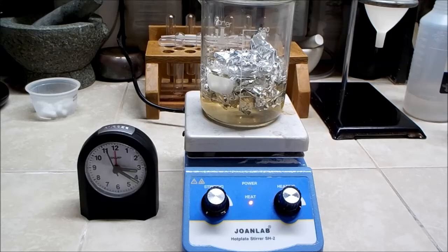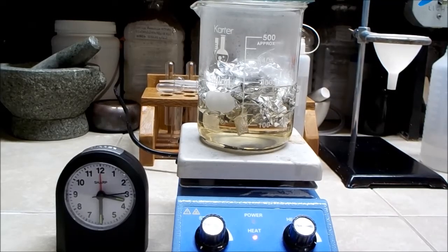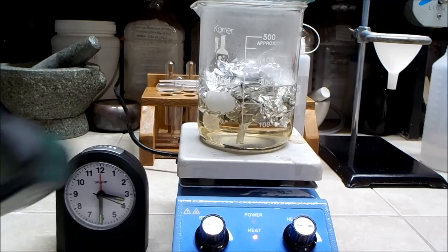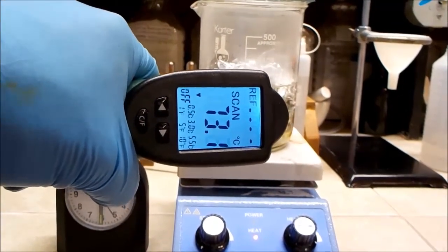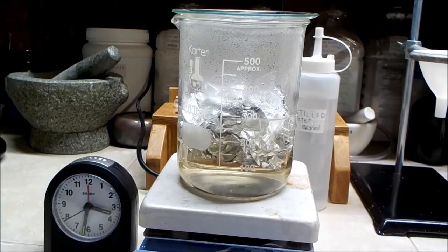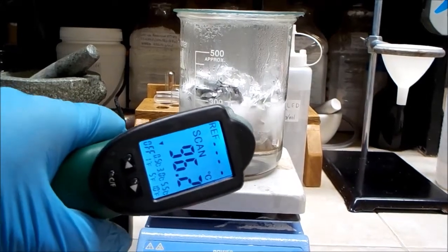I started the reaction about 20 minutes past 3 — let's see how long it takes to react all of the aluminum. The reaction seems to be going slowly at this time. A couple minutes later you can see the hydrogen starting to come off of the aluminum. About 15 minutes in, it's boiling and going quite vigorously.